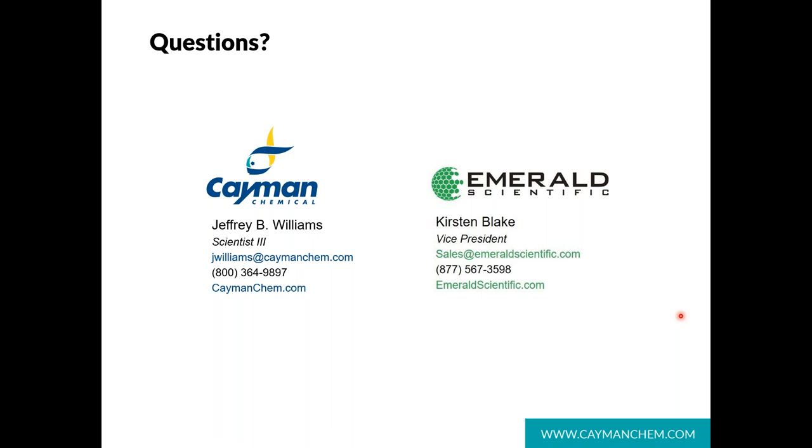Okay, thank you. Next question, has it been possible to separate delta 8 from the isomers of iso-D8? Yes, there's a couple of publications. There was a new Journal of Natural Products paper that discussed iso-THC, and I noticed that they have very close elution, even in their HPLC method, of delta 8 and iso delta 8 THC. I will say they are hard to distinguish. We're working right now to isolate those materials and hopefully provide a standard in the future. But separation of those will be very taxing if it's possible at all.